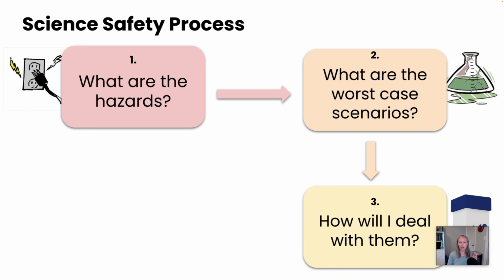For example, if you break something, and literally something is broken every single time we do the first lab in the year and throughout the rest of the semester, come and notify me right away. I don't want you to get hurt from broken glass. Come tell me. I will clean it up and dispose of it properly in the correct container.